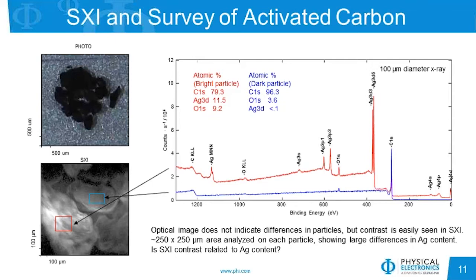see that a couple of these granules are easily visible, and there are some differences in the color of the two, in that one is a sort of monotone, monochromatic gray color, whereas the other one has both dark and bright features. If we wanted to choose a large area analysis across several of these particles, we could do that.